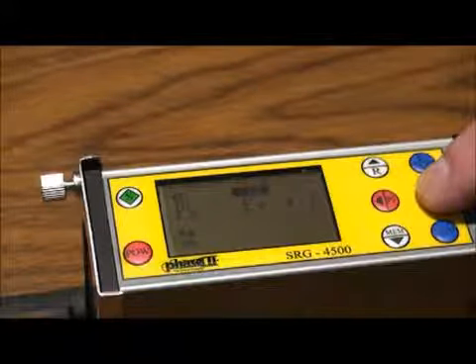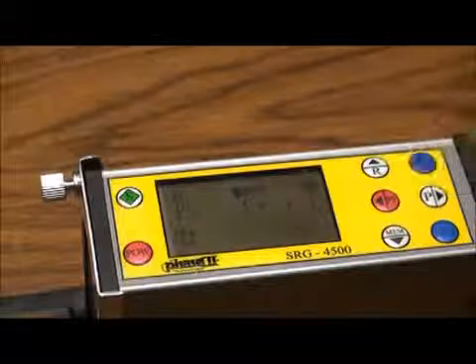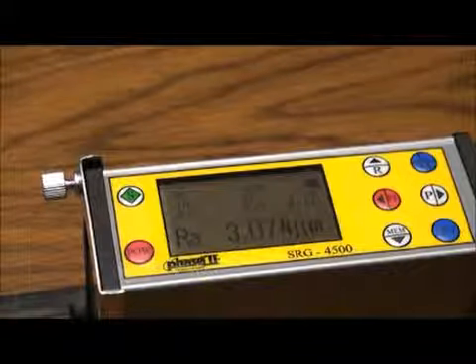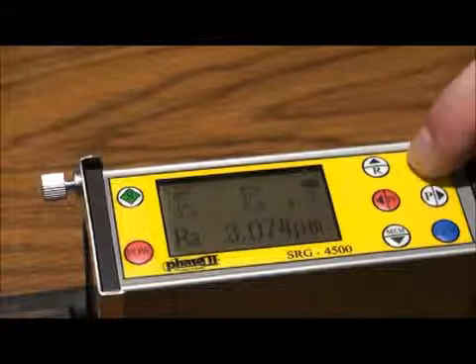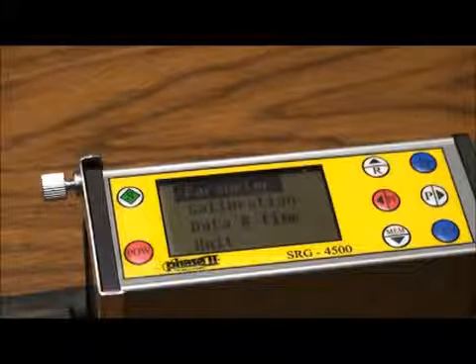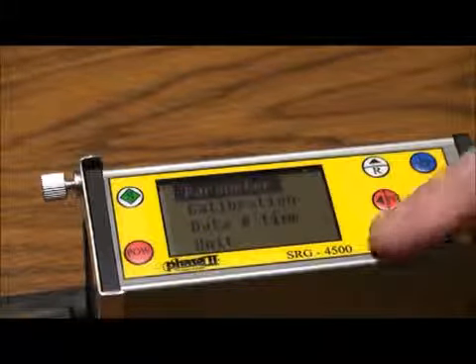Pressing the LM button once will bring you quickly back to the main test screen. Hold down the LM button for about three seconds and this will bring you to a secondary menu screen. Scroll up and down the list using up and down arrows.